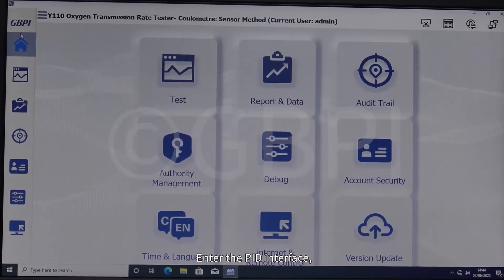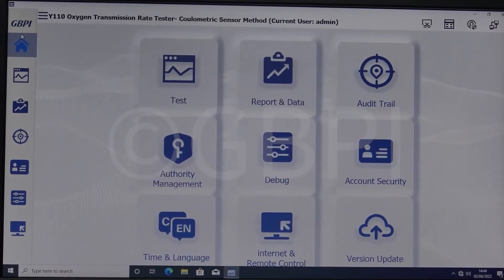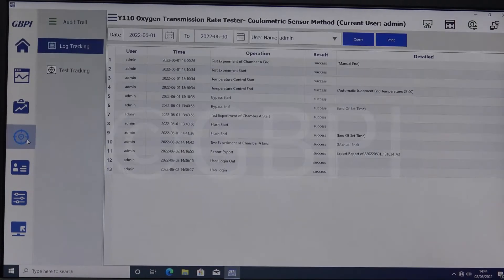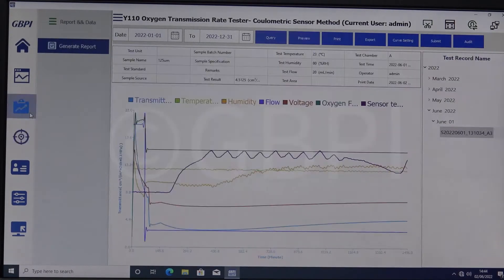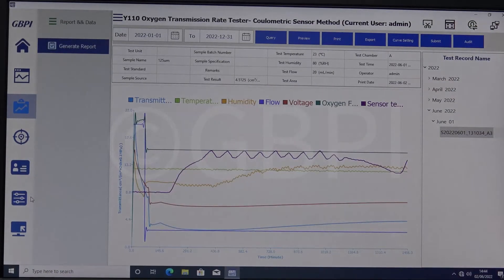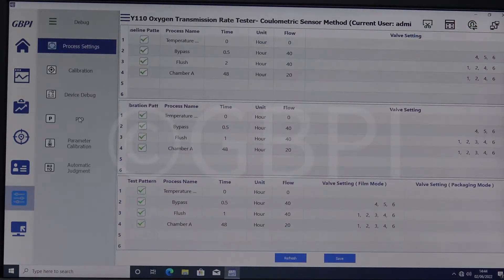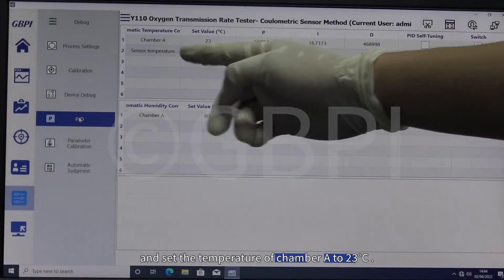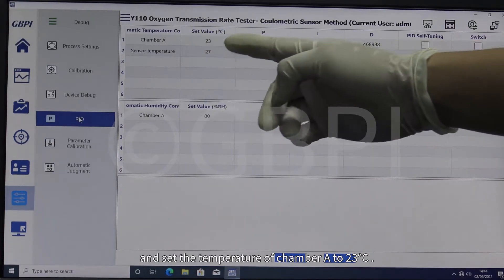Enter the PID interface and set the temperature of chamber A to 23 degrees Celsius.